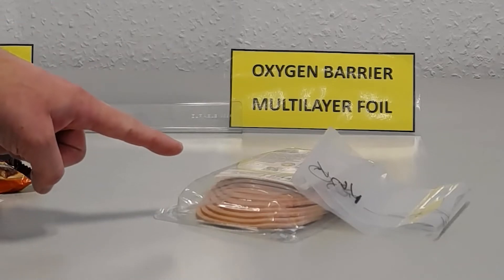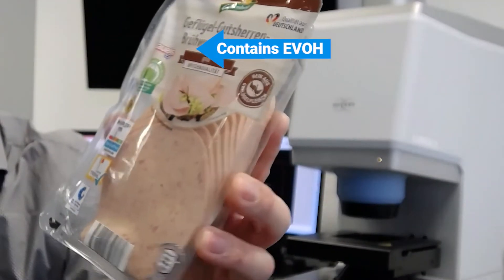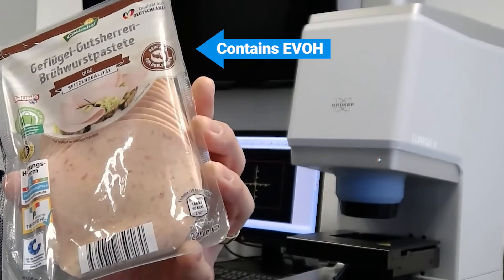This is food packaging. This kind of multilayer packaging foil usually contains a very thin EVOH oxygen barrier layer.